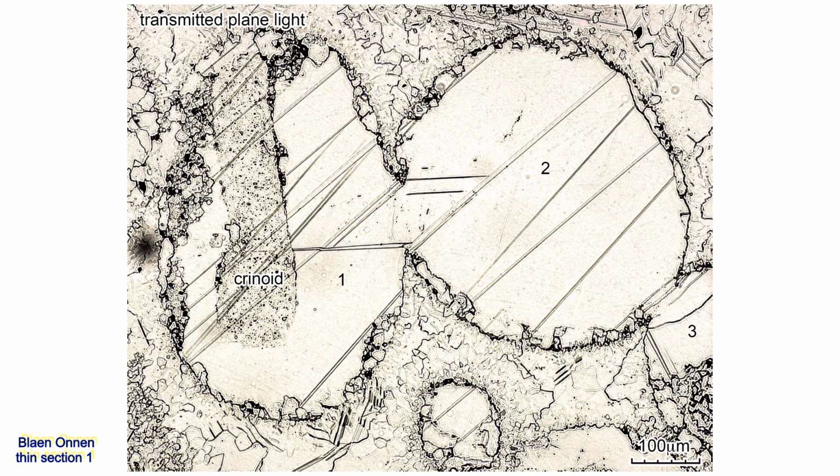The three bodies labelled 1, 2, and 3 were ooids, but have had their cortices completely dissolved, resulting in oomoles, which were then filled by 3 different solids. The first was calcite cement crystals that grew from the oomole's walls a few microns towards their centers. Their terminal euhedral surfaces were then made irregular by dissolution.